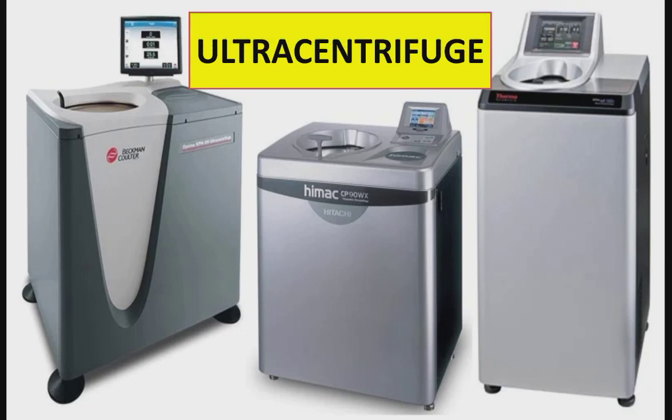So today in this lecture we are going to study about ultracentrifuge. In the previous lecture we have seen what a centrifuge is, what the principle on which a centrifuge works is, and what the different types of centrifuge are. So one of its types, that is ultracentrifuge, we are going to discuss today in detail. In this we will also see the principle of ultracentrifuge, the advantages and disadvantages of ultracentrifuge, and their applications in different industries.